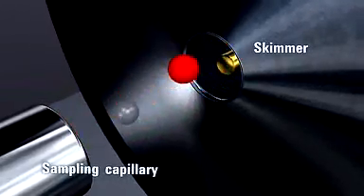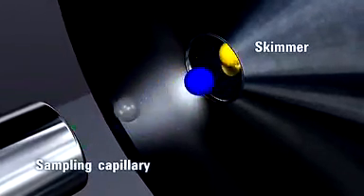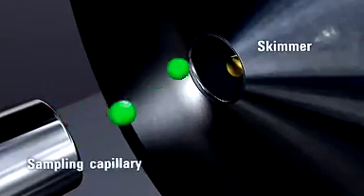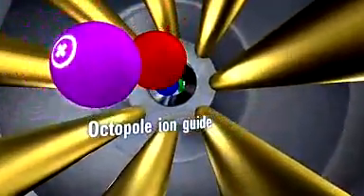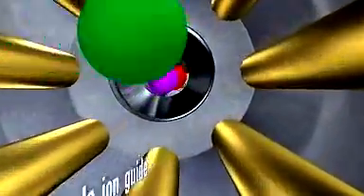A thin skimmer aperture, carefully matched hole size, and short capillary to skimmer distance reduce beam broadening. An on-axis octopole ion guide provides nearly 100% ion transmission over a wider mass range.